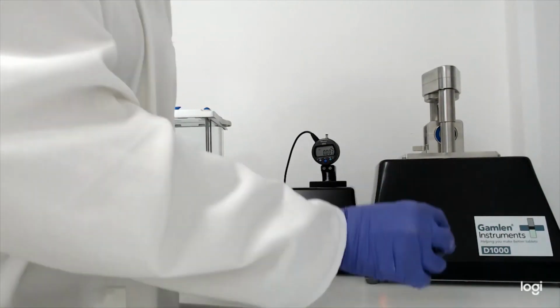There you just saw the die that was filled with powder. So next we're going to tap it.